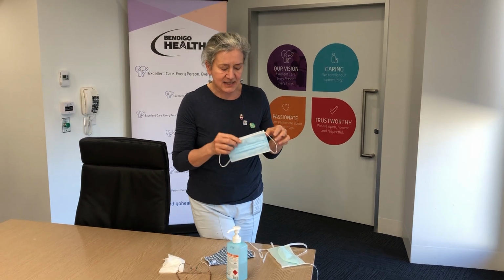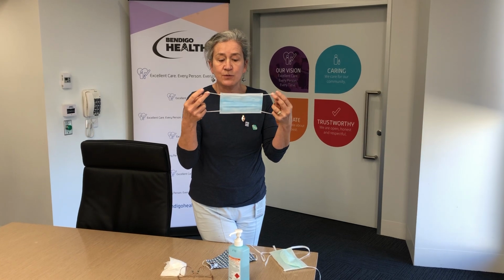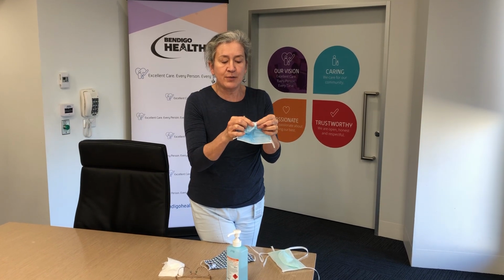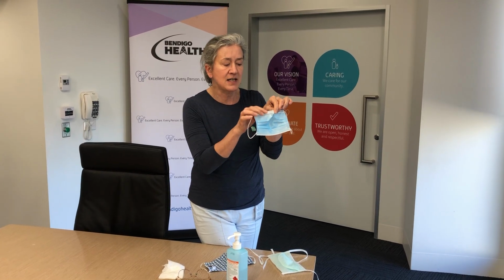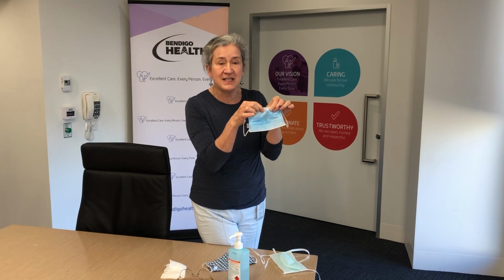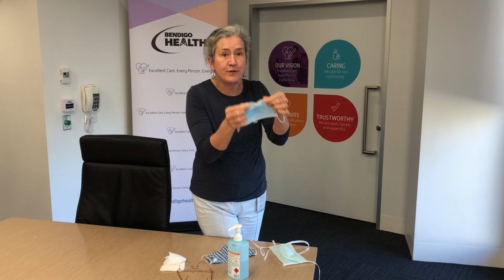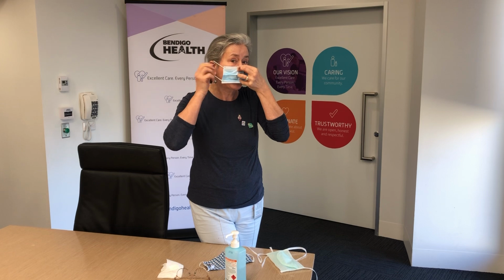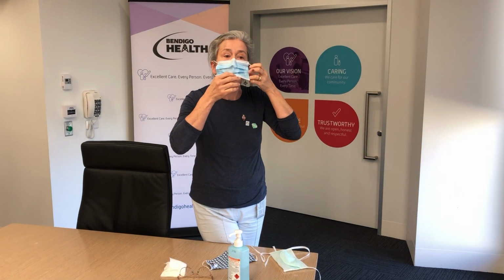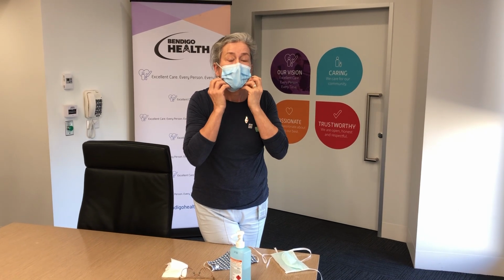The simplest mask that we are providing at Bendigo Health is the surgical mask with the elastic bands. It would be my practice to ensure that the coloured part is on the outside and the bit with the stiffened piece is at the top. And I try and form that to my nose before I put it on, and then I pop it on, hold it tight, put one ear thing over one ear, the second ear thing, and then make it as snug as I can around my face.